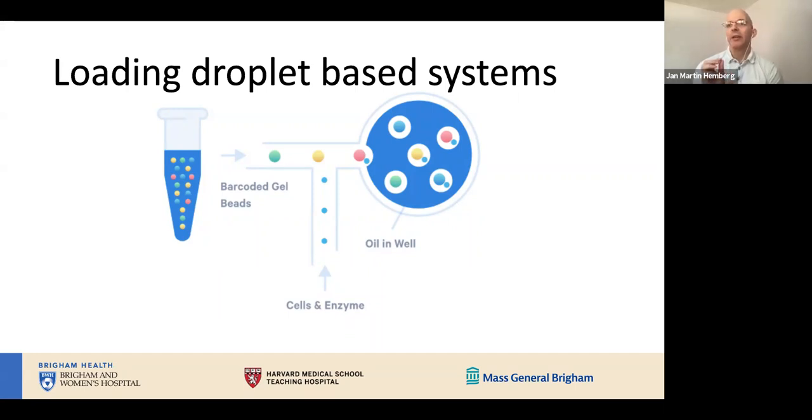each droplet. So now you need to strike a balance. On the one hand, that's basically something you control when you put your cells into the machine. The number of cells controls the rate of this Poisson parameter. And if you put too few cells into the machine, then you'll have a very low rate. So the problem then is that you'll end up with a lot of empty droplets, and that is basically a waste of these reagents. That means you'll get fewer cells out of your experiment, and it will cost more. The other direction is not good either, right?